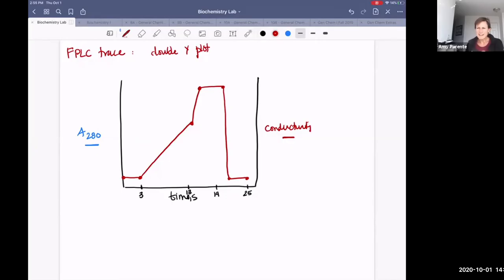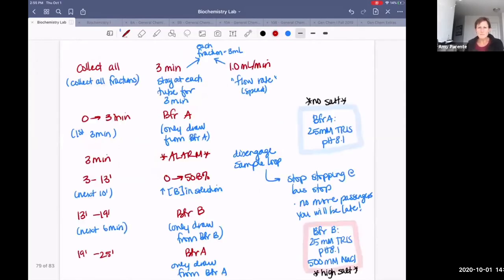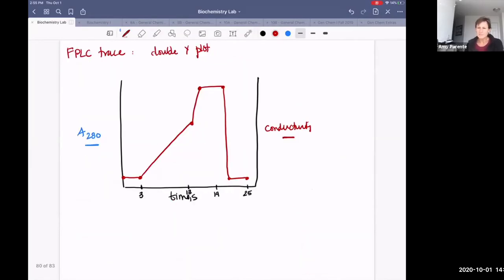So does that make sense to everybody? I was measuring the salt in the solution that was driven by these directions. That's what this should look like. Everybody with me?